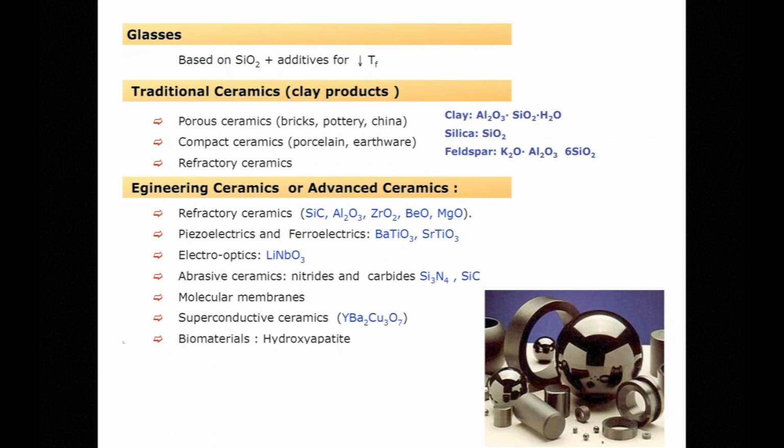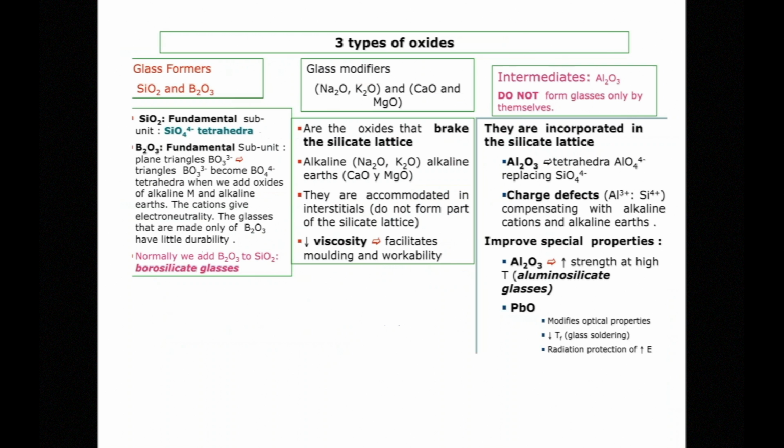So here you can see the wide range of classes, again, classifying them as oxides or non-oxide type of ceramics.